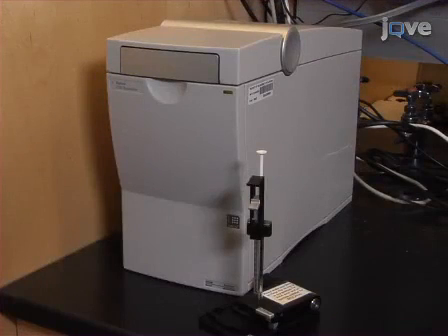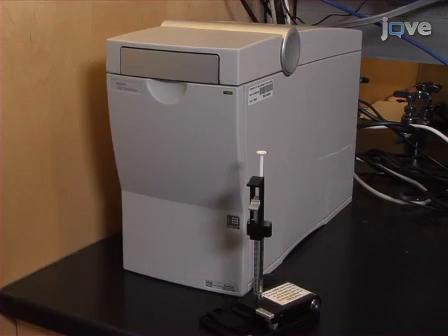Quality control analysis begins with preparation of the 2100 bioanalyzer instrument and chip priming station as directed in the written procedure.